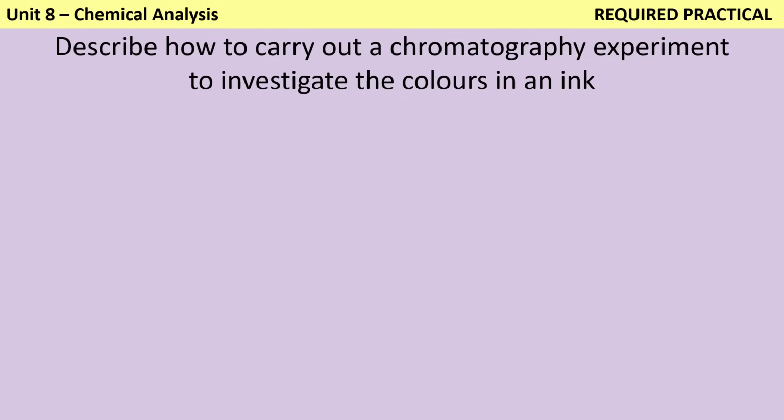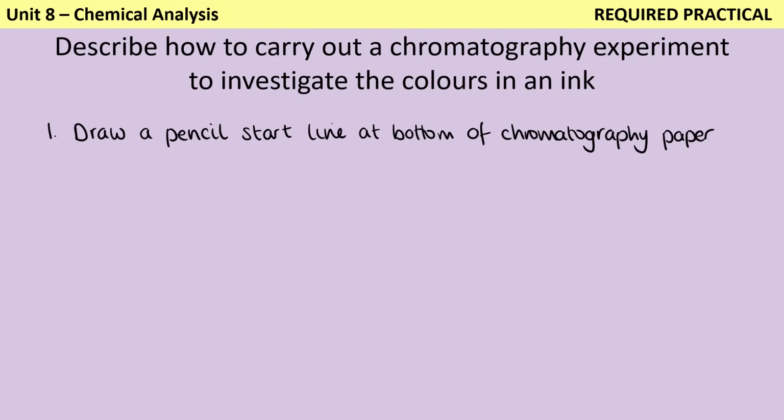So this would be a really straightforward method to write. We'd start off talking about how you're going to draw a pencil start line, and you might want to include that information about how you don't want the start line to run.